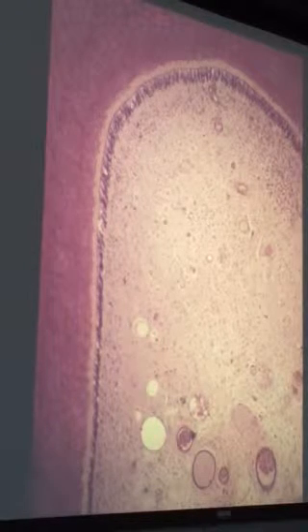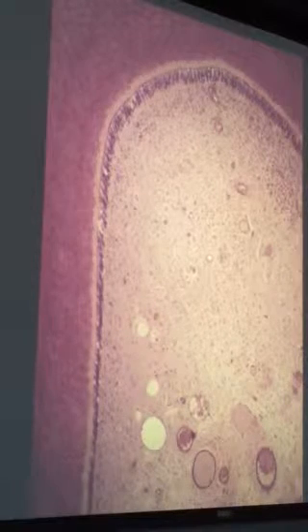Probably in the back of the class, you can't really see that very well, but what is that? Nerve. And we have vessels. On the lab practical, I will not expect you to differentiate between an arteriole and a venule, but you should certainly know the capillaries and the lymphatics.